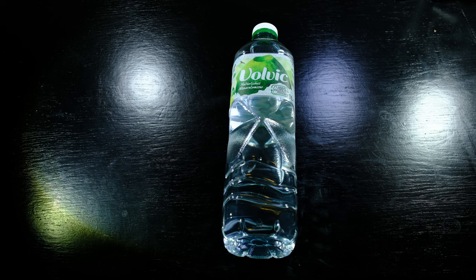Here is what we need. A bottle of still Volvic mineral water. This water is the perfect medium for all kinds of amoeboid creatures. If you don't have access, try other brands of high-quality mineral water without CO2. Don't use fizzy water. It will tickle the amoebas to death.